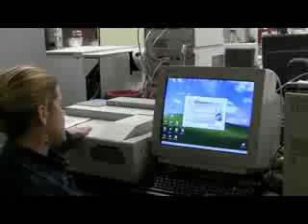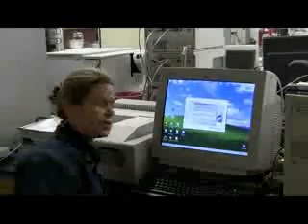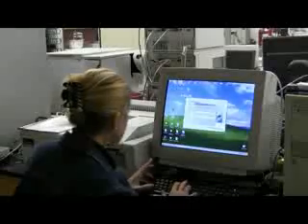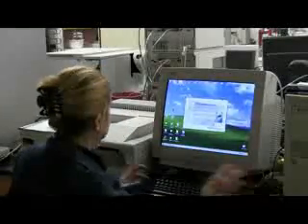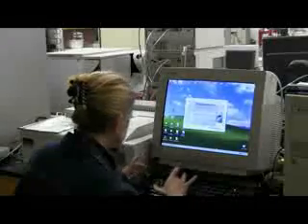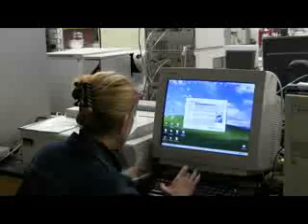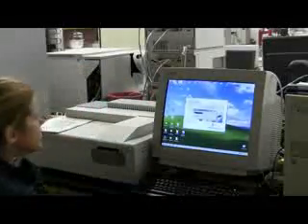And there it is. Username. Okay, here we go. There it is. Analyst is the username with a capital A. Analyst. And the password is student109, not capitalized. STUDENT 109. Okay. All right, we're initializing.